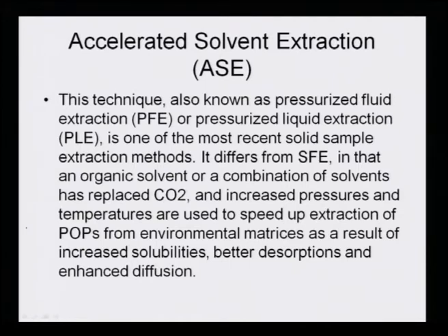Again and again, I am emphasizing the various methods of extraction and their differently named methodologies, because if you come across different terms, like PFE or PLE in place of ASE, it is one and the same method, which means that there is an accelerated method for doing the extraction process.